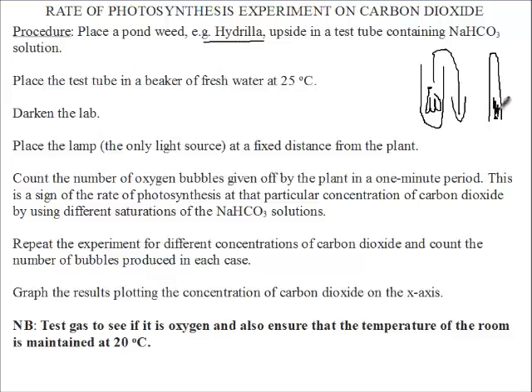leaves pointing upwards. Now we place the test tube in a beaker of fresh water at 25 degrees Celsius. At 25 degrees Celsius. That is why we need our thermometer, so that we will use that to measure the temperature all the time.